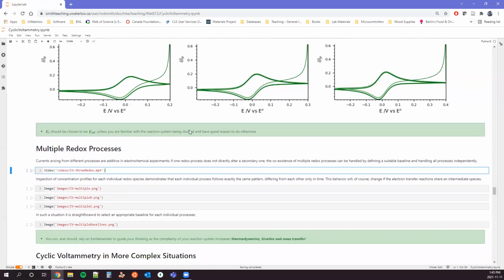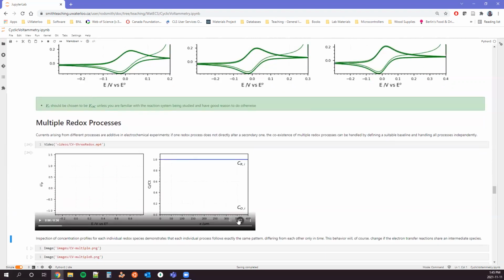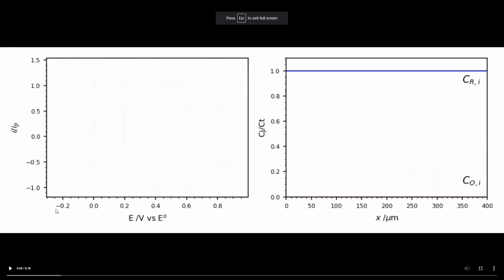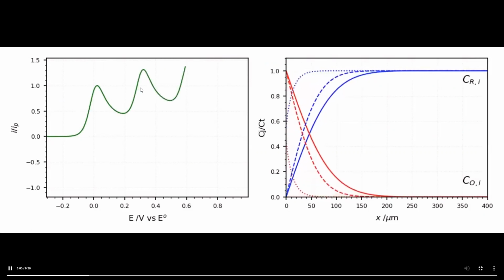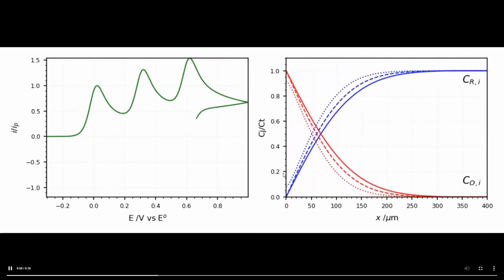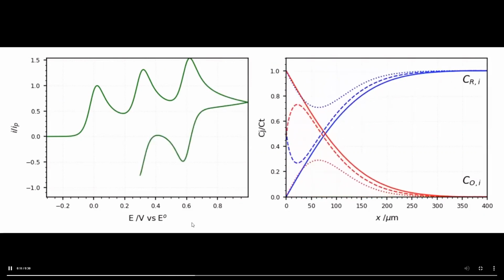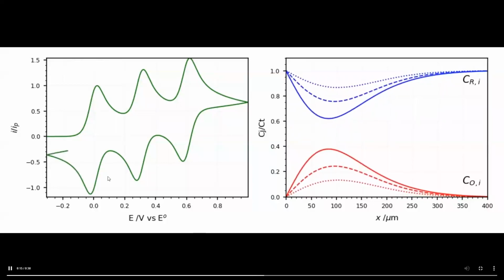Those, of course, are the ideal situations. So we can move away and start looking at more complex situations. Currents are additive. If we have multiple things happening in a solution, they're just going to add together. Here's an example of three distinct redox processes in a solution where none of them are interacting with each other. We can see the CV for process 1, 2, and 3, we're oxidizing them. And we can see that the diffusion currents for them are exactly the same. They're just delayed by some time.